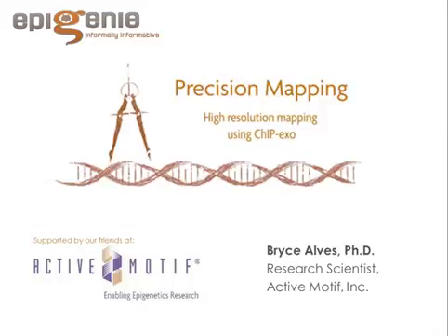We usually run the ChIP-Exo samples and sequence them, and then to confirm that it is in fact a binding site, we have carried out qPCR to look at that binding site. We've of course used the ChIP-Exo data to design primers and then gone back. Another way you can also look at it, with standard PCR, is by using walking primers if you'd like to see if it's protecting it or not.